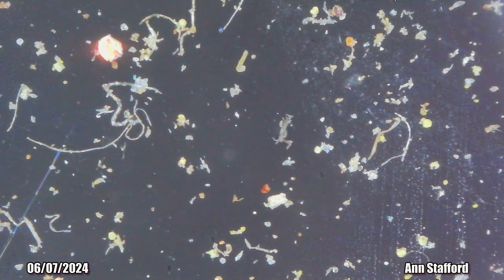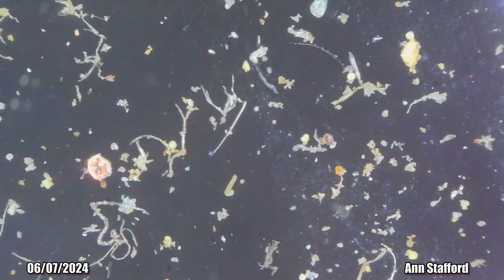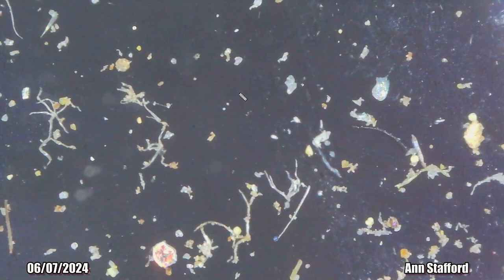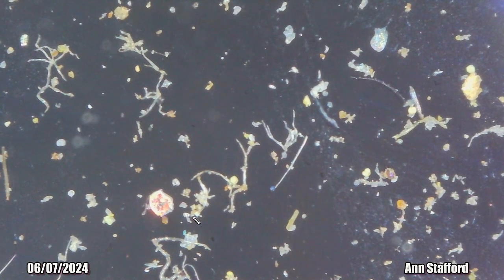But let's just look at some Hydra. Here's the little V shape. And there's a big V shape. And I notice a lot of V shapes, honestly. I see them a lot, large and small. See? Okay, look, that looks a little different.